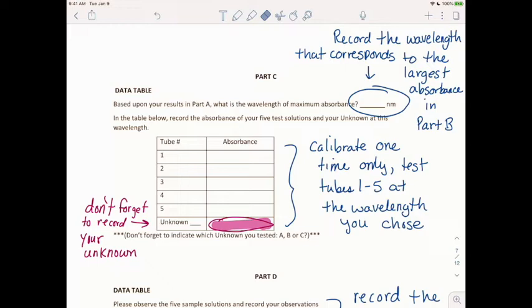So in the video you saw the individual there using what we call a cuvette. It looks shockingly like a test tube, but it is not. So in class I would have handed each of you about 4 or 5 of those cuvettes. Again, they look a lot like a test tube, but they are very smooth, and the reason they're smooth on the outside is to prevent the light from bouncing off any scratches. So I would have told you that we never put a test tube cleaning brush in there, and we never even use any paper towels.